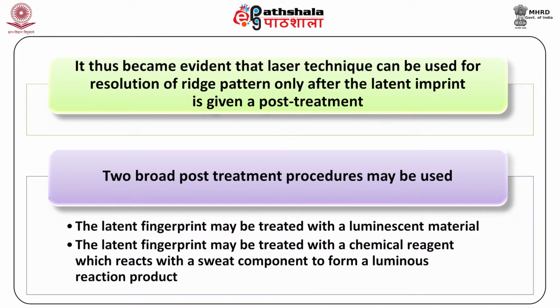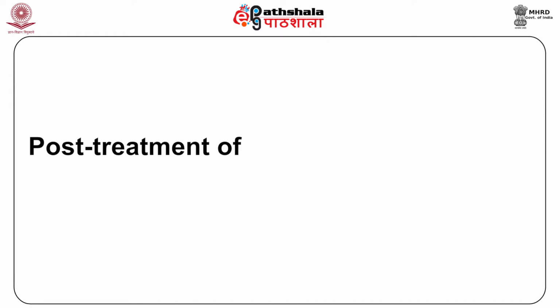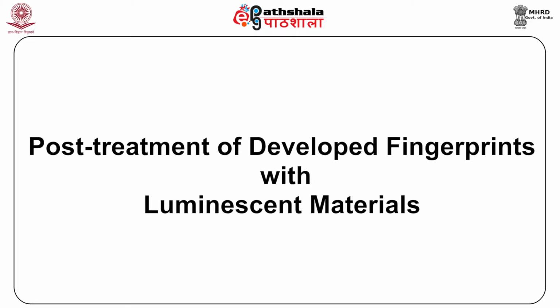utility. It thus became evident that laser technique can be used for resolution of ridge pattern only after the latent imprint is given a post-treatment. Two broad post-treatment procedures may be used. Number 1, the latent fingerprint may be treated with a luminescent material. Number 2, the latent fingerprint may be treated with a chemical reagent which reacts with a sweat component to form a luminous reaction product.